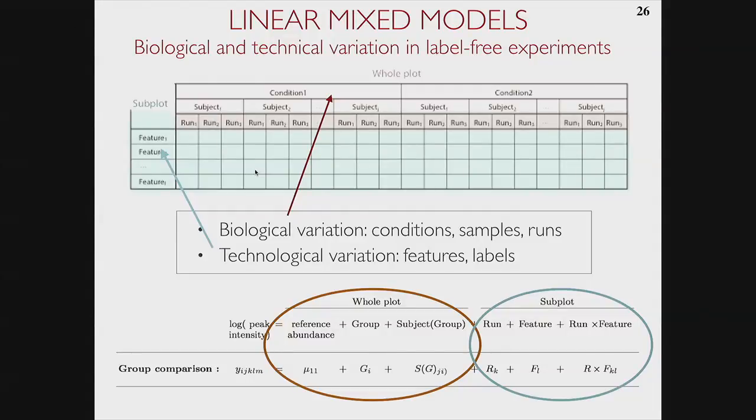I emphasize the fact that you summarize differences between the groups, but you can also say, I want to summarize all the numbers which pertain to this particular subject across maybe all the technical replicates, all the features, and so on. This is what is called subject quantification in MSstats, and you use a similar procedure. MSstats will give you a summary which accounts for missing values or holes in the data, which gives you one number per protein per subject. So this will be summarizing multiple features, label-based, label-free, all taken together.